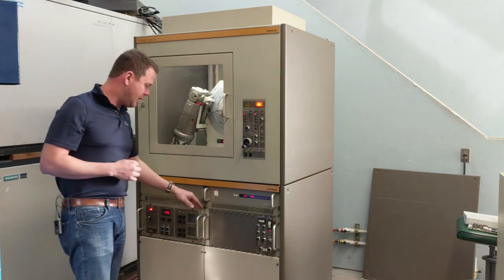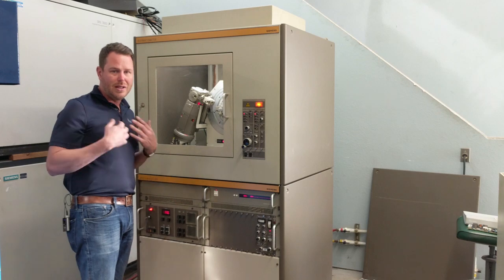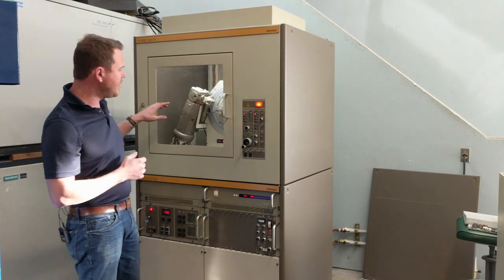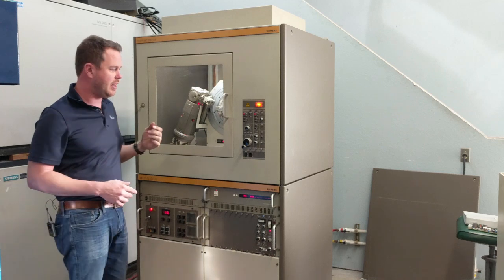These machines are very easy to service because they've separated a lot of the electronics out into individual circuit boards, which makes our life a lot easier keeping these things running in perpetuity. The D500 uses a leaded glass window, just like all of the other systems, rated to 110 kV.